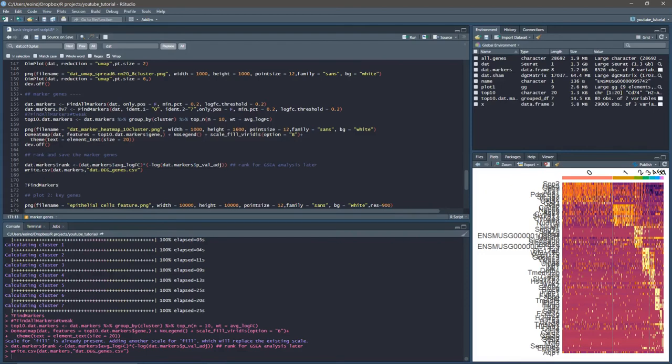All that's left then for you to do is to assign a gene set enrichment analysis rank. I find this is far better than things like over-enrichment analysis for when you're looking at gene ontologies. There's a number of different ways to generate a rank. The way I have found, and the way that others in Biostars forums seem to be using, is this formula here as follows. So assign a rank to each gene. It makes a lot more sense really when you're comparing one cluster to another as above, rather than one to every other cluster. But I would suggest webgestalt.org as a wonderful, really convenient way to output gene set enrichment analysis really fast.